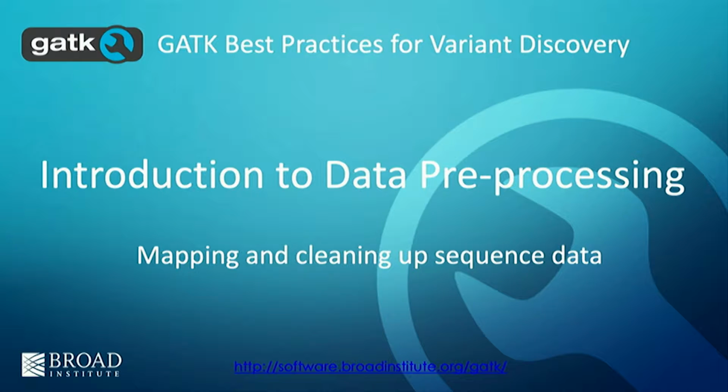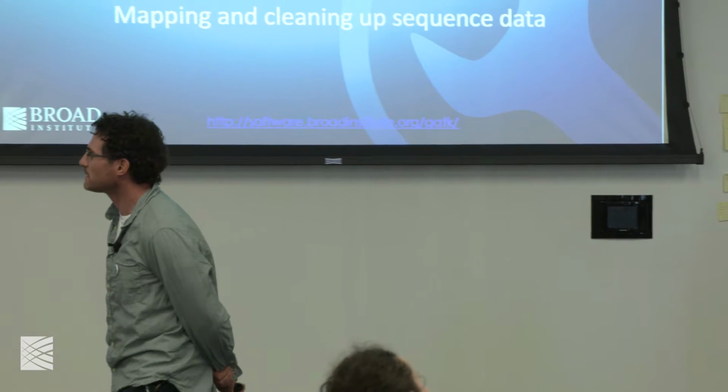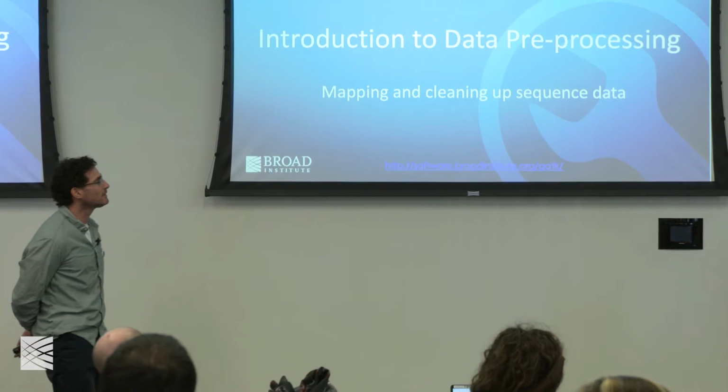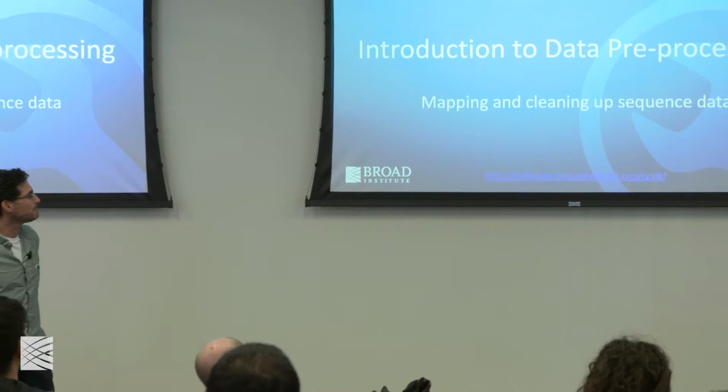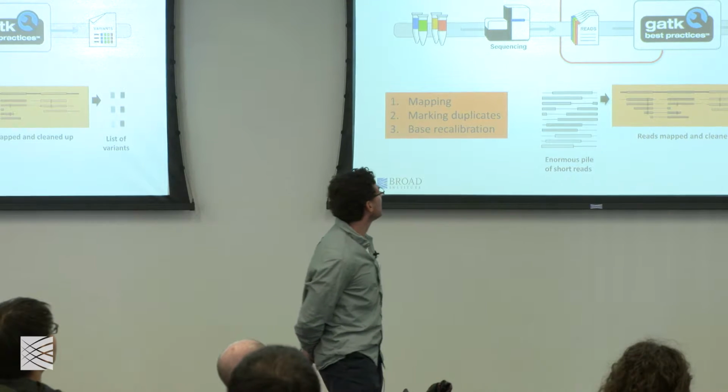And this is going to be just a brief introduction to the data preprocessing that we do on the genetic data, mapping and cleaning up the sequence data.